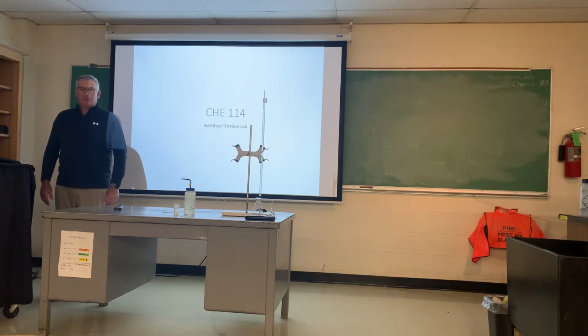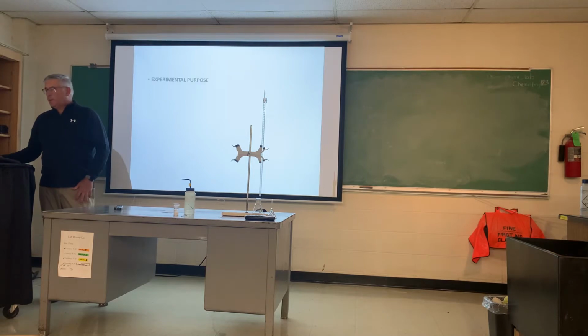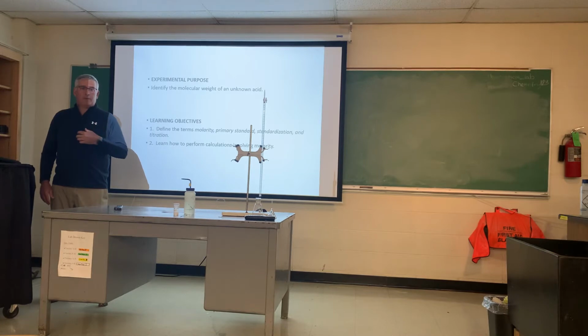Welcome to General Chemistry Lab. This week we're going to be working on a titration. It's an acid-base titration, and so we're going to actually do two titrations. The first one is a standardization. We're going to make a sodium hydroxide solution of an approximate concentration, and then we're going to standardize it so that we know the concentration very exactly.